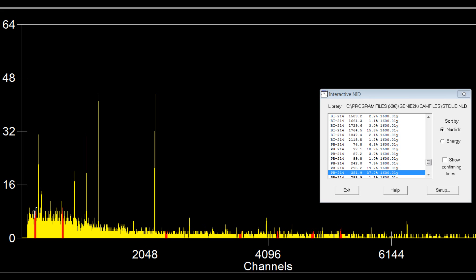The channels you can see on the horizontal line correspond to the gamma energies, which are characteristic for the different radioisotopes. And on the y-axis on the left, you can actually see how many impulses are in each bin that corresponds to that gamma energy.